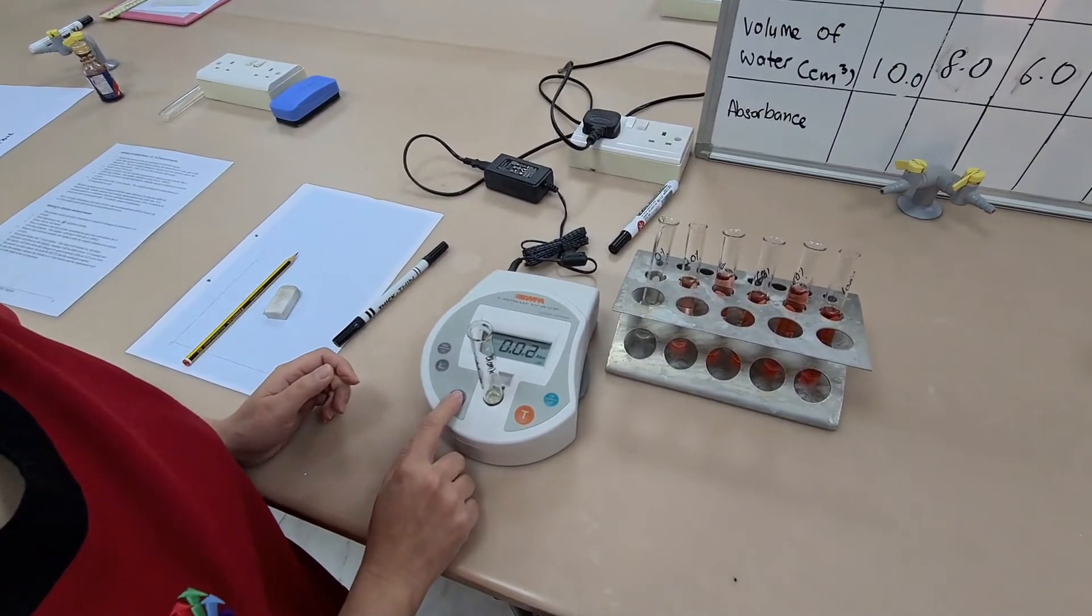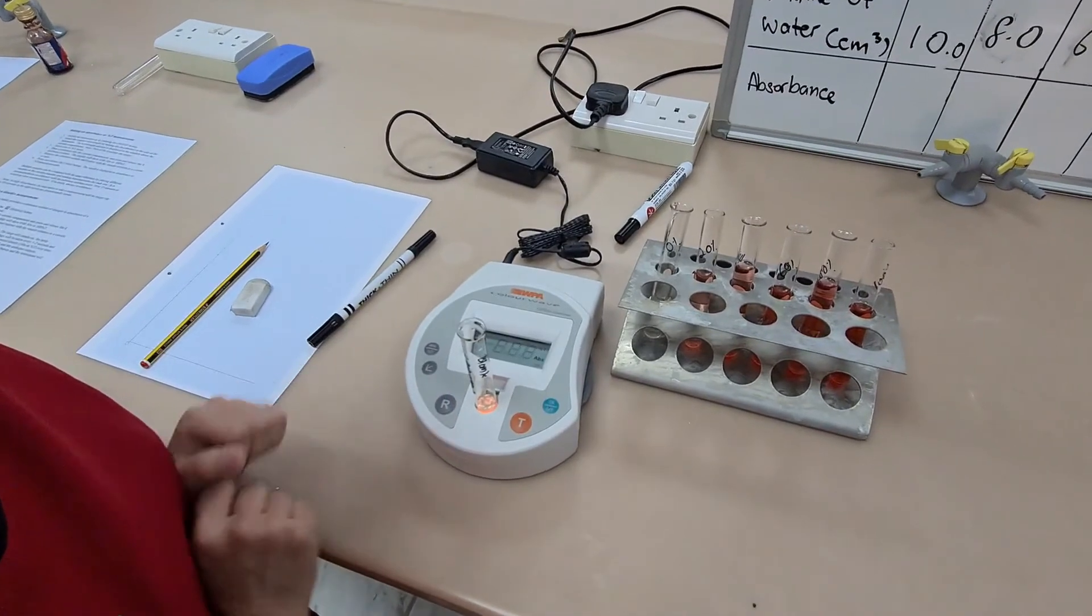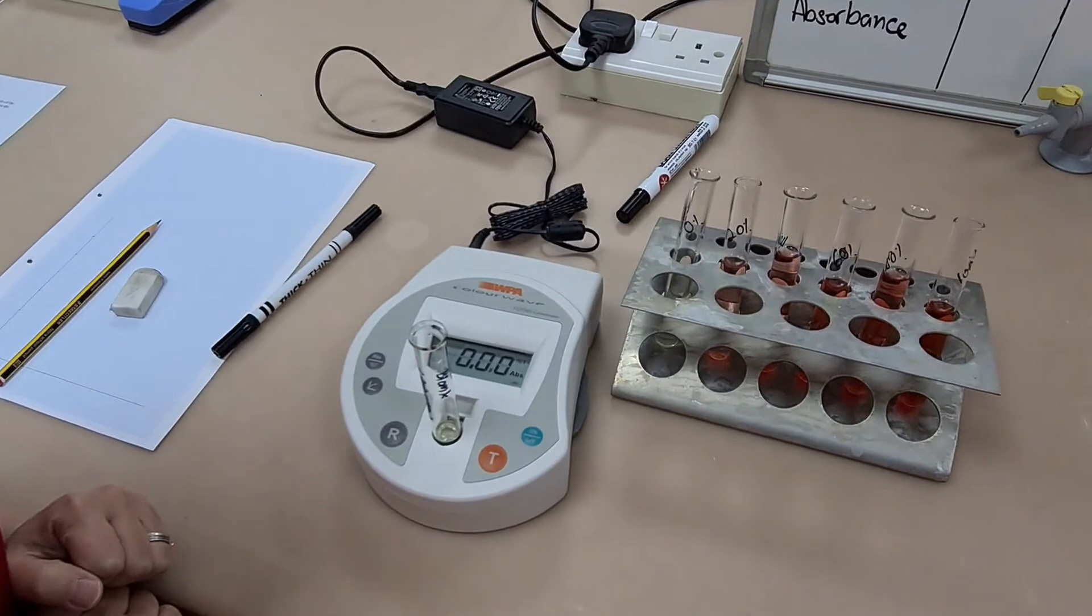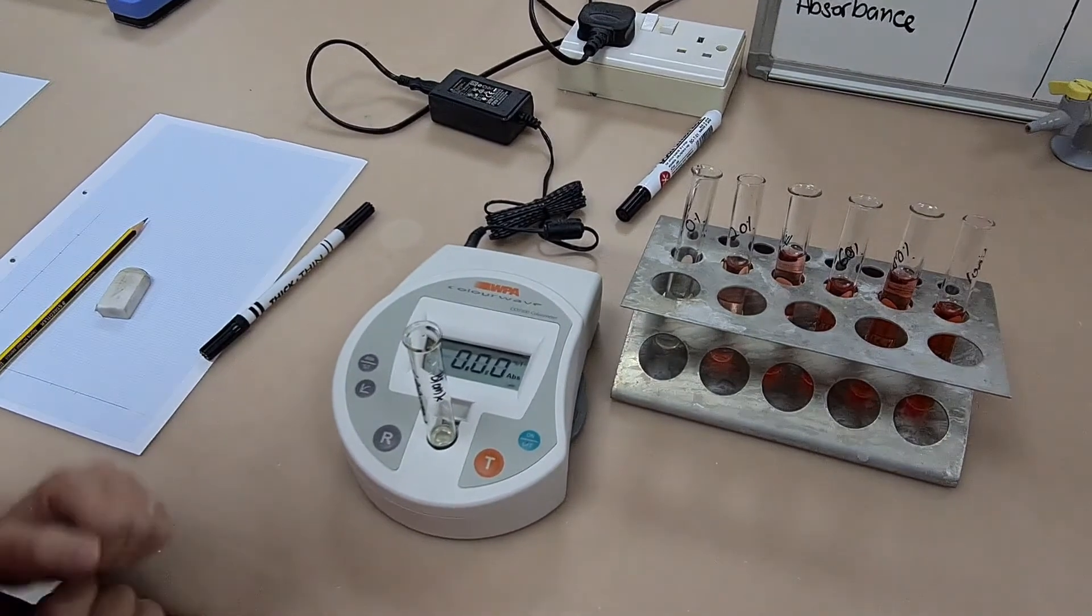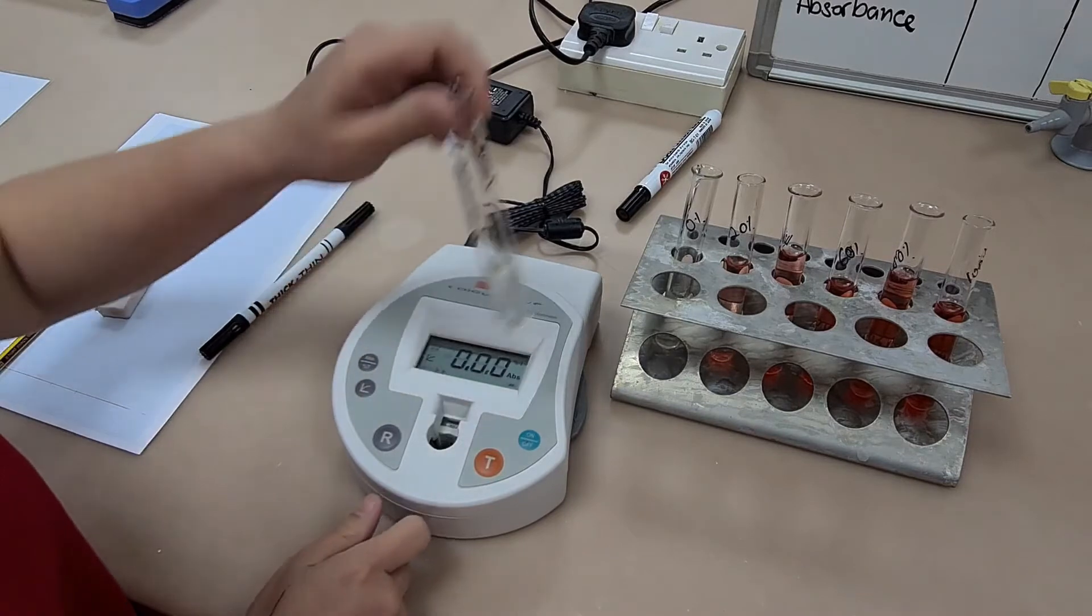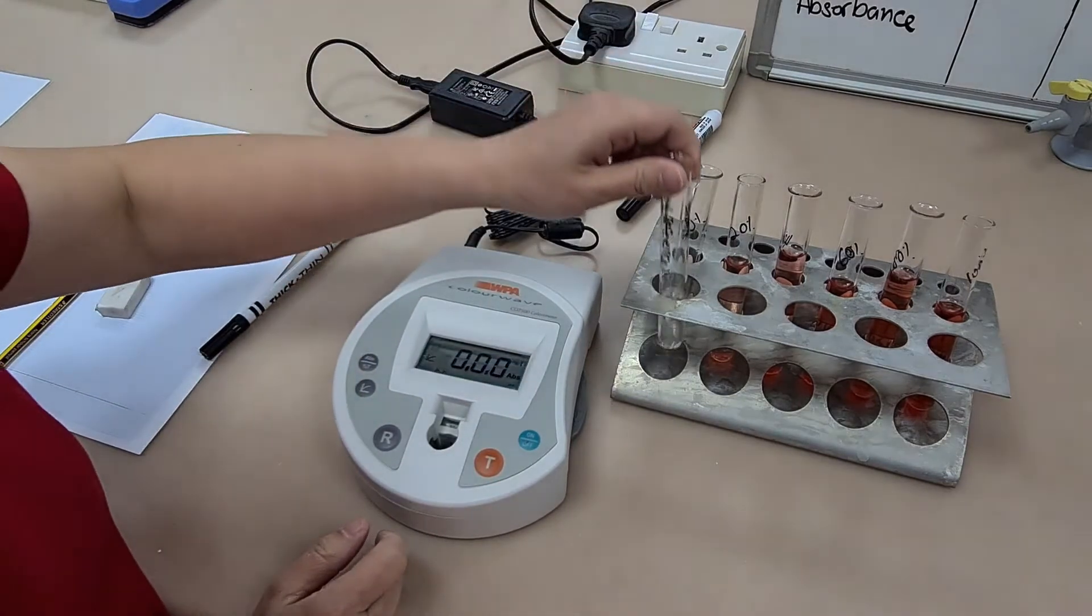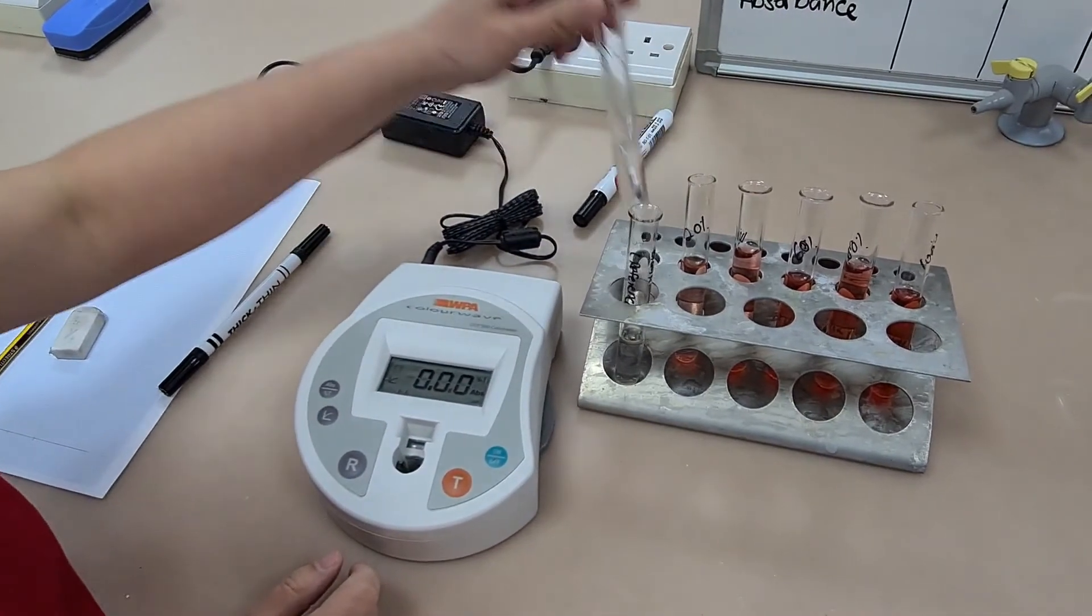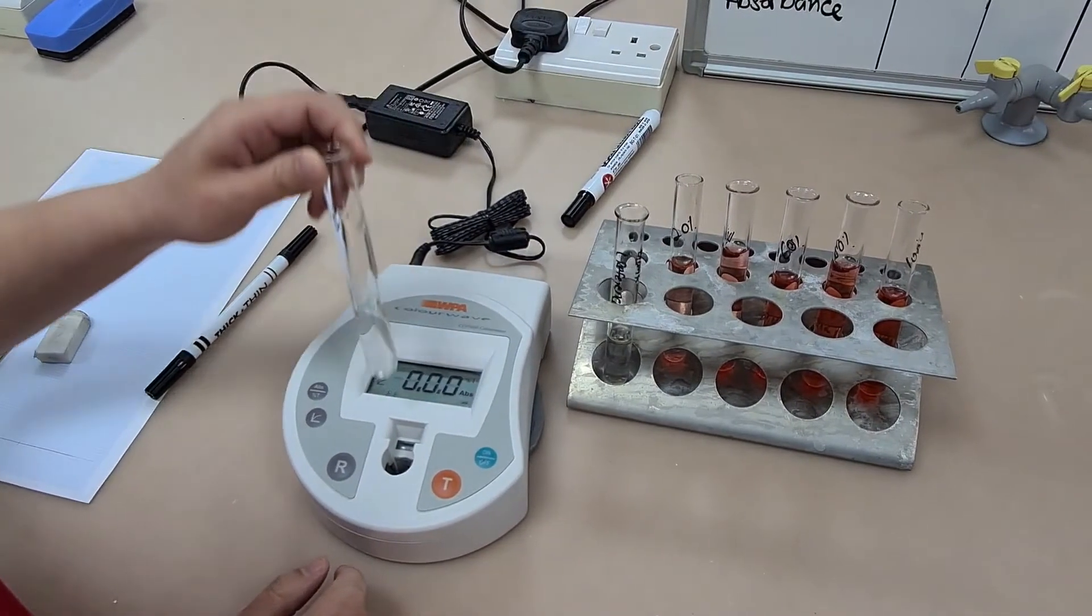Then you need to tare the colorimeter and that just means taking it to zero, very much like you would do with a digital balance. Now in this case we are calibrating our colorimeter with water but that's not always the case. For example, if you were using a Benedict solution you might tare it with a blue solution first.